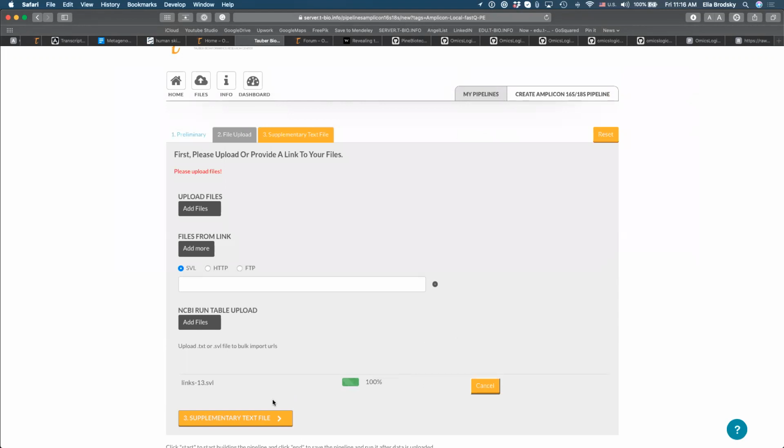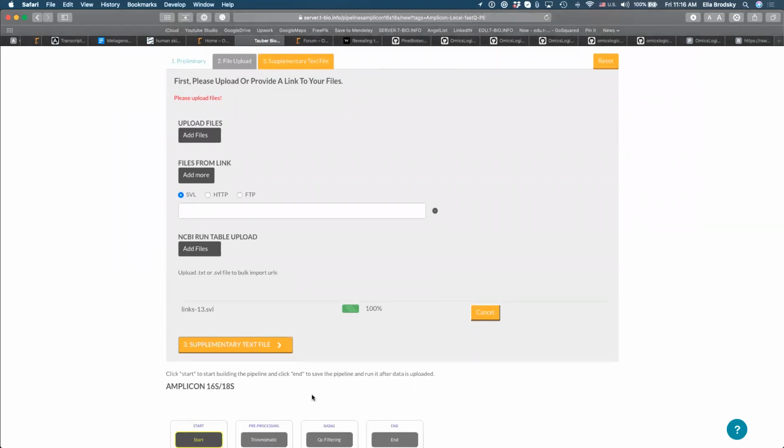And then next you will see this button, supplementary text file. Did everyone get to this step? All right, so let's go to supplementary. Okay, that means you're in the wrong place. You probably tried using it from here, but you need to add from down below here.